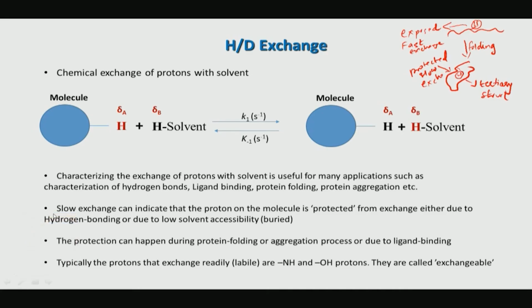So, this can happen during protein folding. Hydrogen exchange, therefore, is a very popular experiment to study this folding process, and we look at how these hydrogen exchange rates, the chemical exchange between solvent and the proton, change during this process.